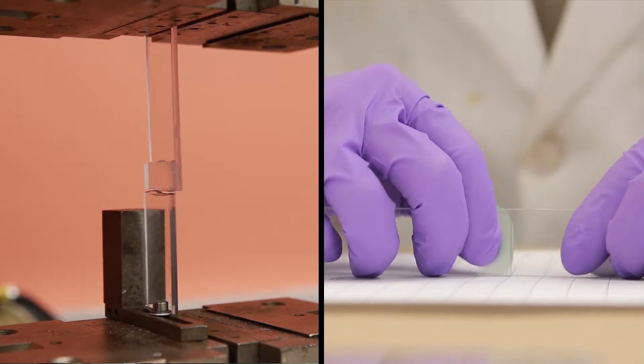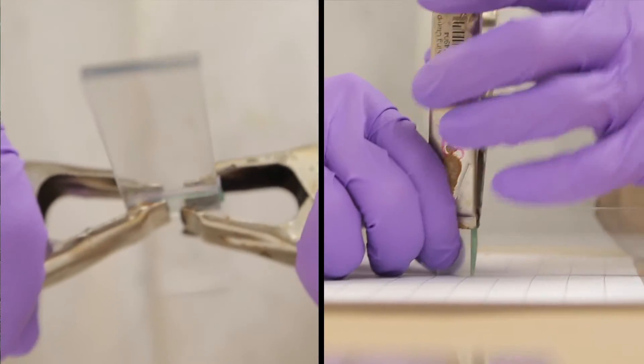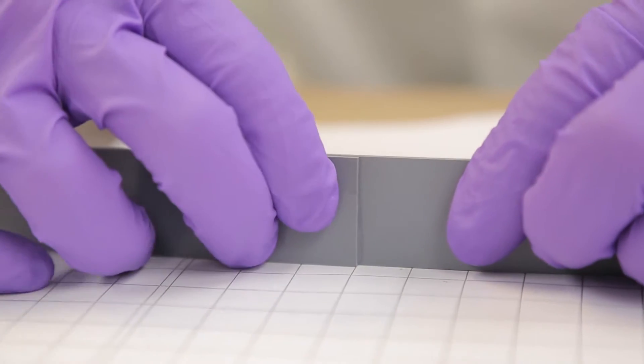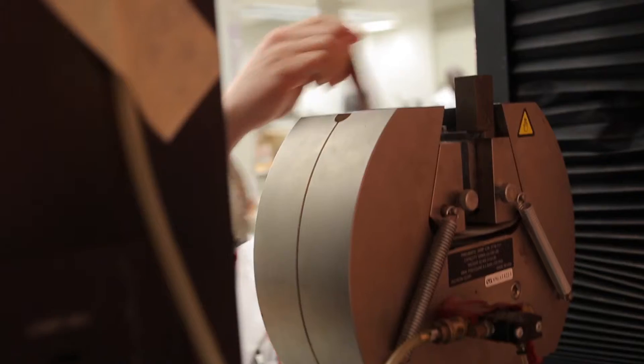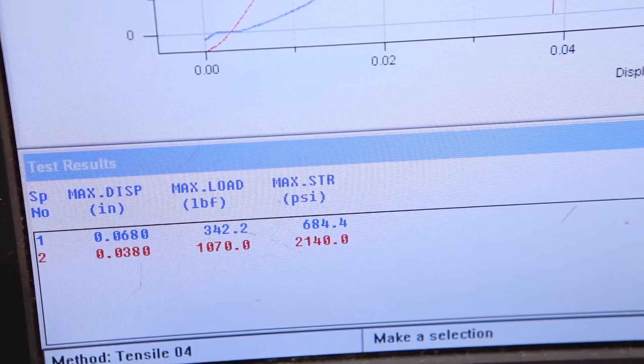Adhesive shear strength tests are important for characterizing the structural integrity of a bond between two surfaces. One standard method for shear strength testing calls for the bonding of two test specimens overlapped by a specified area. The assembly is secured in a mechanical properties tester and is pulled in shear until failure. We record the load at breakpoint and calculate the corresponding shear stress.